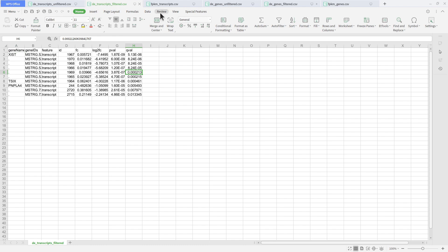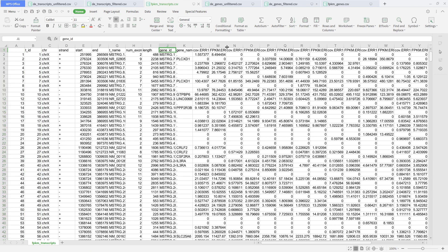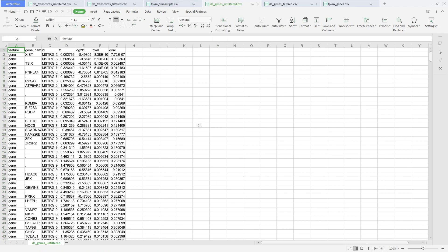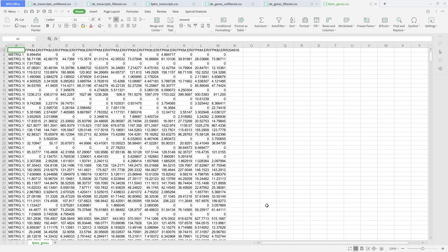We also have the filtered one here which you can check. There are also the FPKM values we generated for transcripts — here you have the IDs, the genes, and the FPKM values themselves. We also have the information for the genes: unfiltered, filtered, and then the FPKM values.